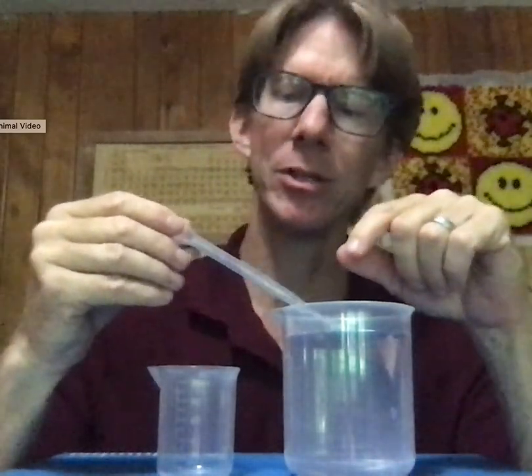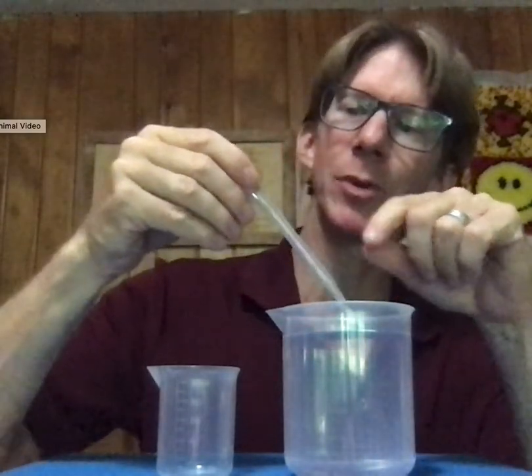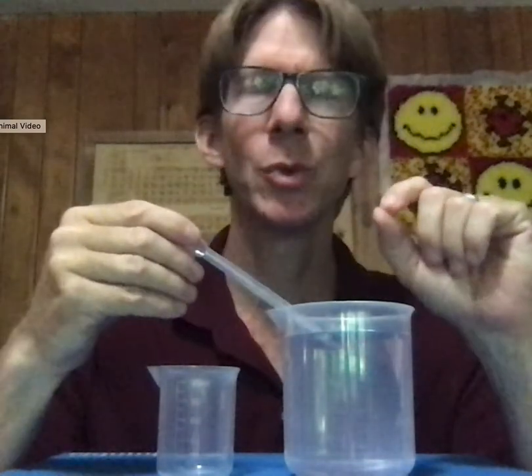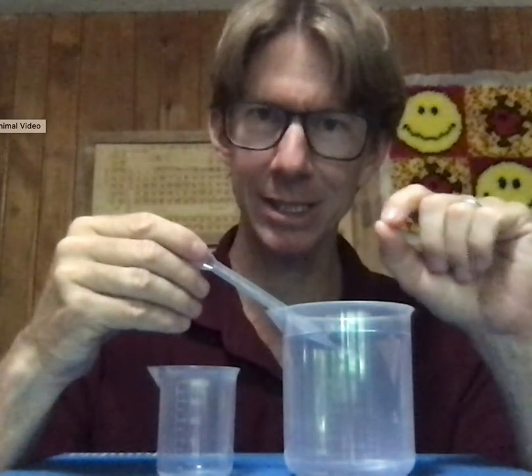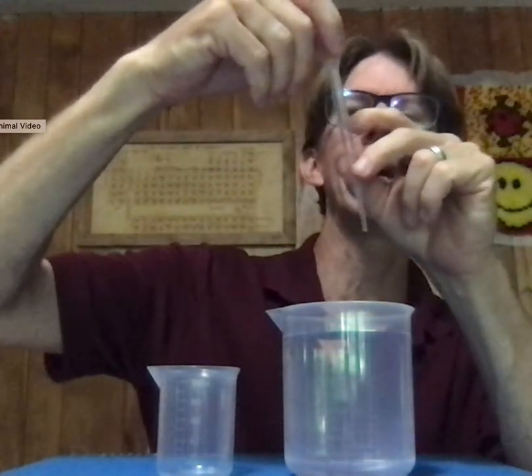The meniscus is the shape of the air-water interface. Sometimes it will be curved up, sometimes it'll be curved down, and sometimes it'll be flat. When using a plastic pipette, the meniscus depends on whether you're sucking up or blowing out. What is most important is that whatever the shape of the meniscus, you read the center of the meniscus in the center of the pipette, and that center is right on the 2.0 line.